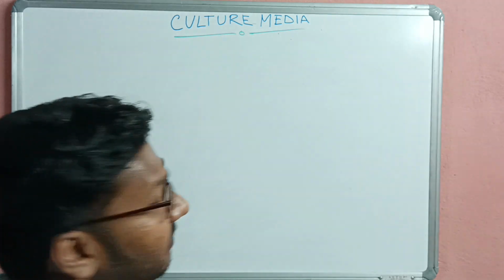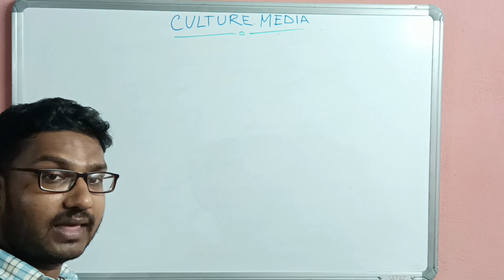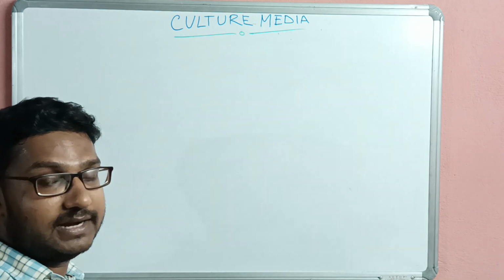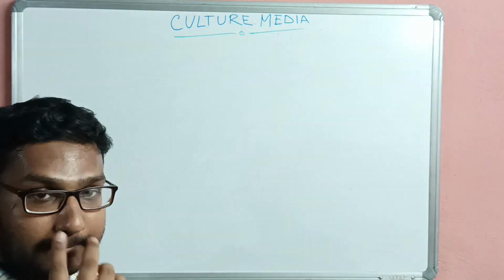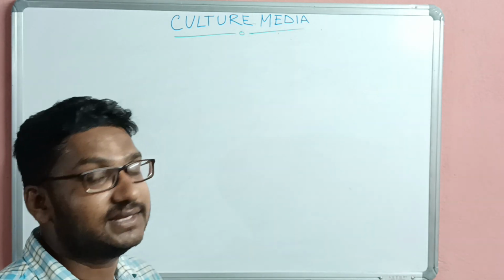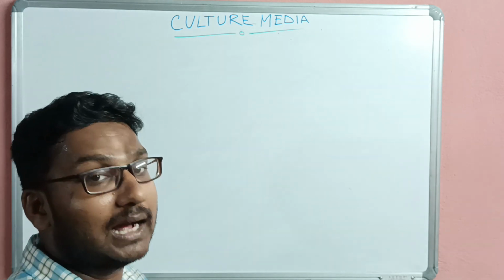This is called the culture media. As per different criteria, depending on the growth and nutritional status, we subdivide it into different parts. Before going into this, we will discuss agar powder.